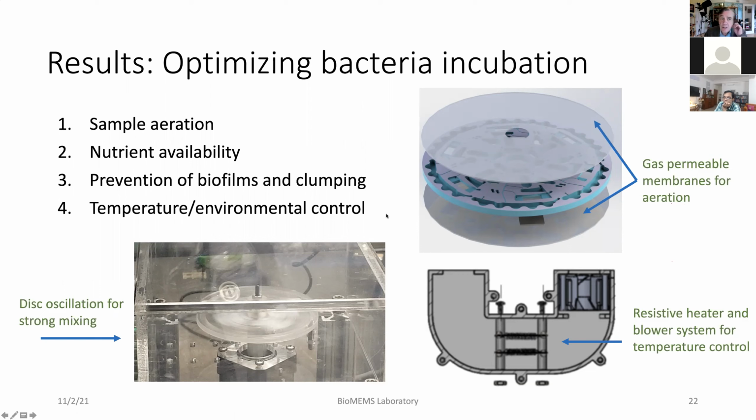And so we make sure that we learn the exact amount of nutrient for them. We prevent the formation of biofilms and clumping, and we do good temperature and environmental control.